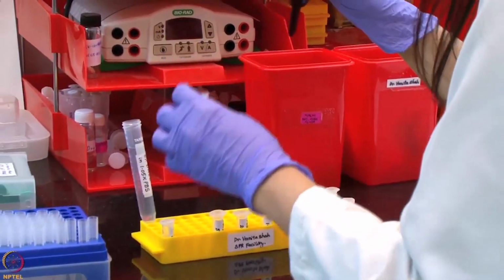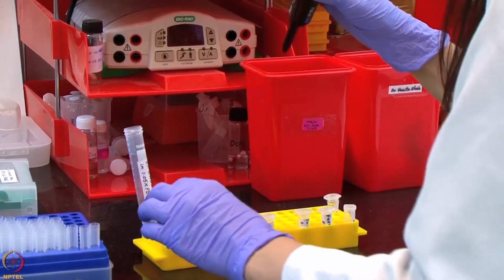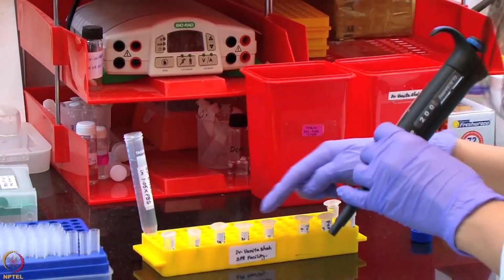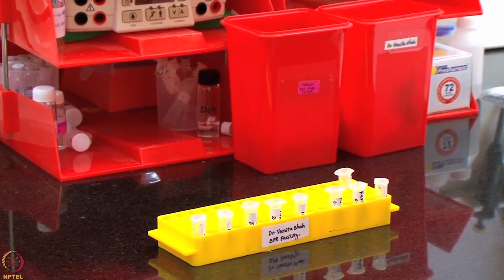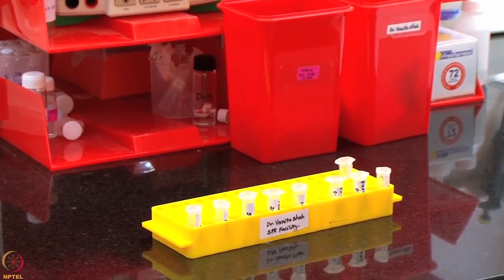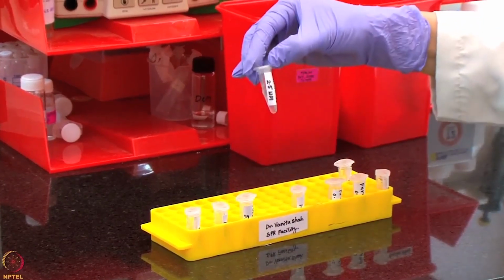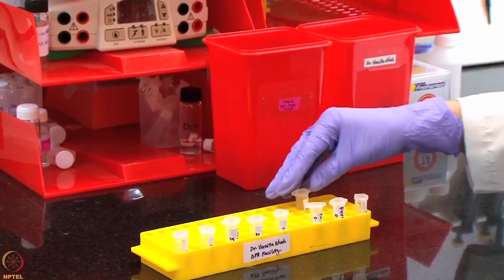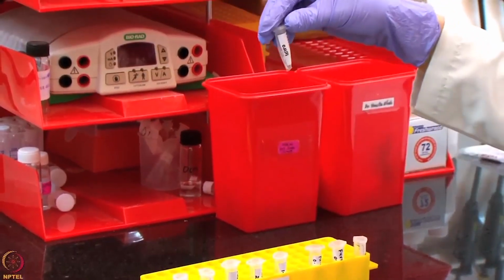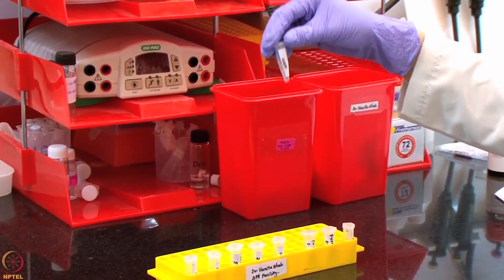We similarly continue the two-fold dilution to obtain the rest of the concentration series. One of the concentrations should be run in duplicate. So here in this experiment, we will be running 2.5 micromolar concentration in duplicate, and we will also include 3 zero concentrations, which will be nothing but the running buffer.